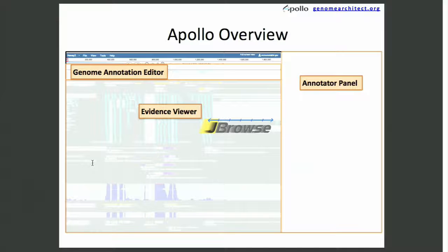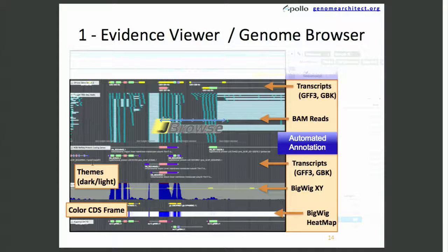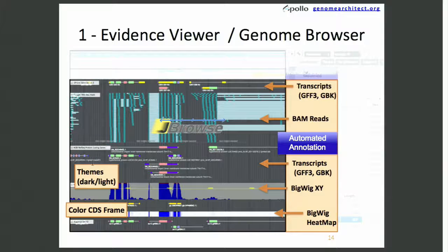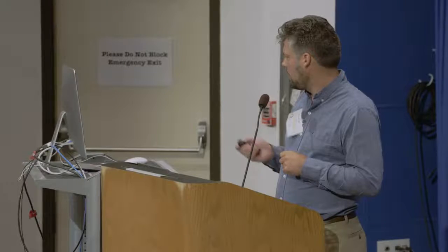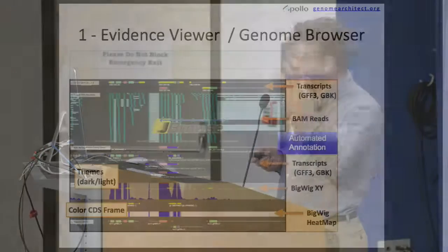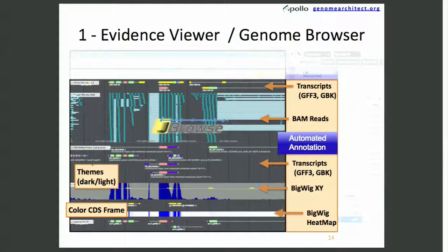Apollo is split up into three sections: an evidence viewer, which is driven by JBrowse, a genome annotation editor, and an annotator panel. The evidence viewer is essentially JBrowse, and this allows users to read various types of files — BAMs, GFF3, GenBank, VCF, BigWigs, and probably a couple others. Through Apollo, we can theme it multiple ways, and there are even more JBrowse themes. We also allow coloring of the CDS frames. These typically come off of the automated annotation tracks that you're doing upstream with tools such as Galaxy and others.